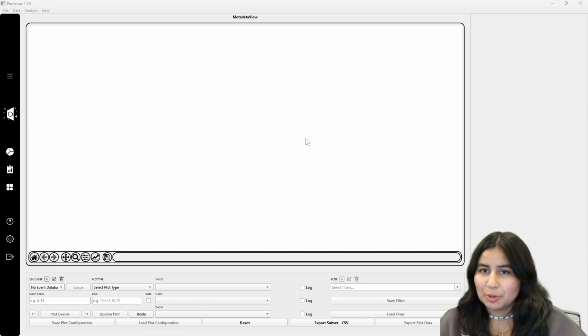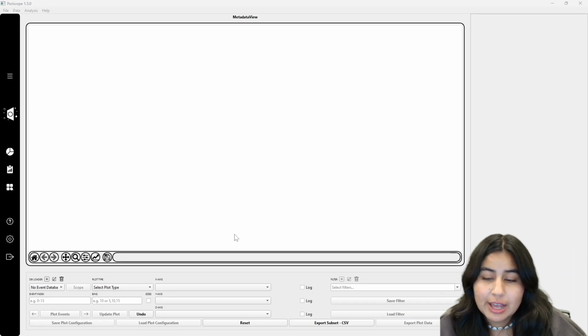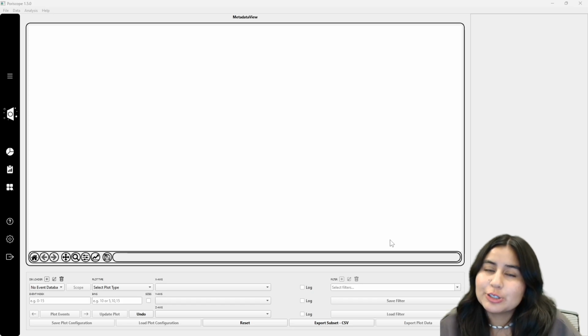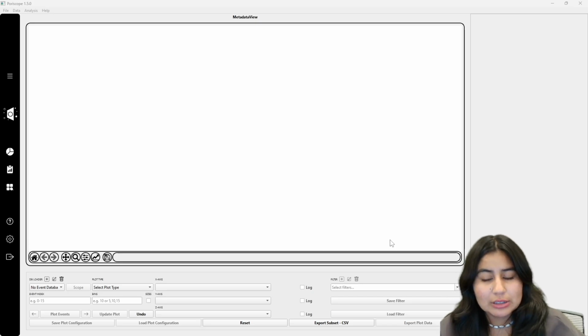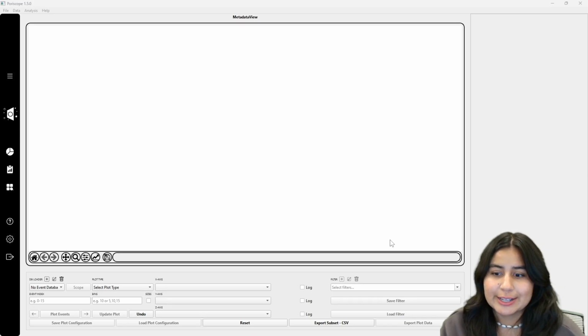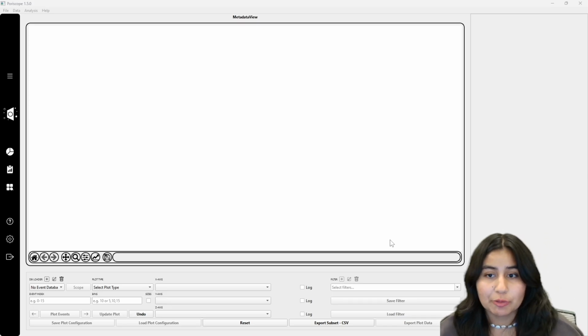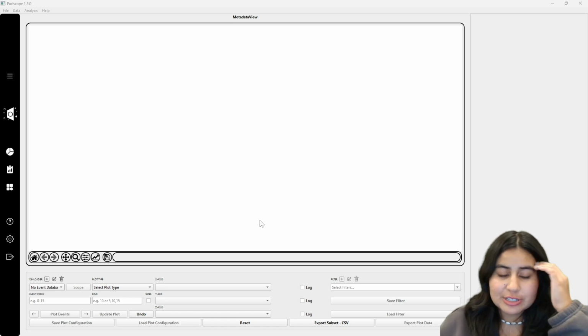So let's explore our metadata tab. First thing first, like in the other tabs, we're gonna be looking at the milestones. Here we have DB loader right here, and then the filter. But the filter in metadata behaves very different from the filters in raw data view and in the event analysis view. We'll see how that works later, but actually the filter here is what makes metadata such a powerful and relevant aspect of the analysis pipeline. But first thing first, let's get started.